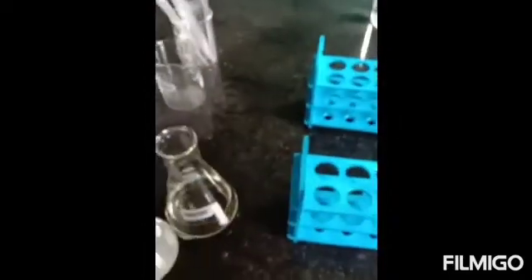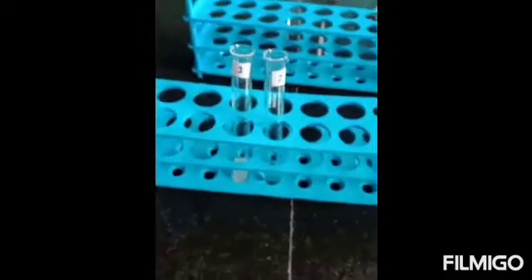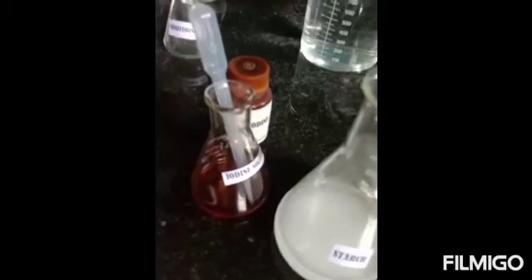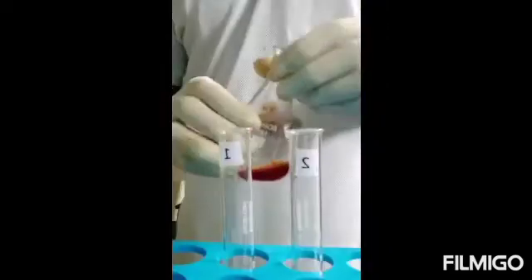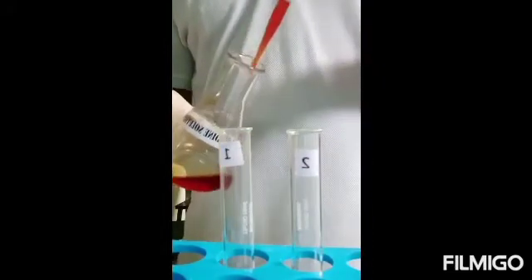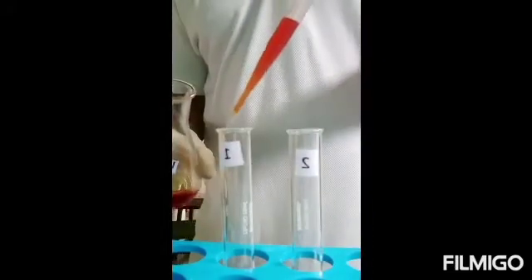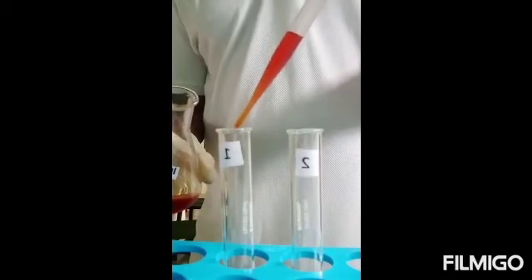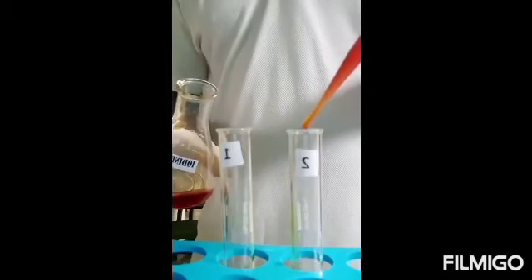To both these test tubes, iodine is added — one or two drops only. To the first test tube, one to two drops of iodine is added, and to the second test tube also. We shake it, and you can see immediately a deep blue color develops in the solution in which starch was taken.